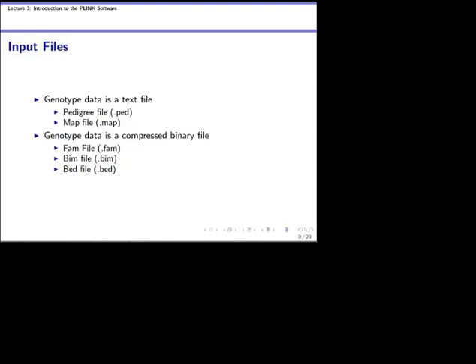Make sure you don't open the binary file. The text files you can view in a regular text editor, but you don't want to open the binary file up. It's going to be a bunch of stars and symbols and things of that nature.